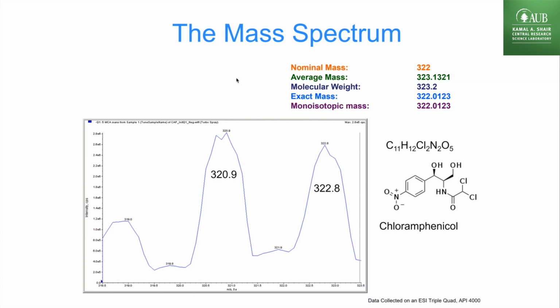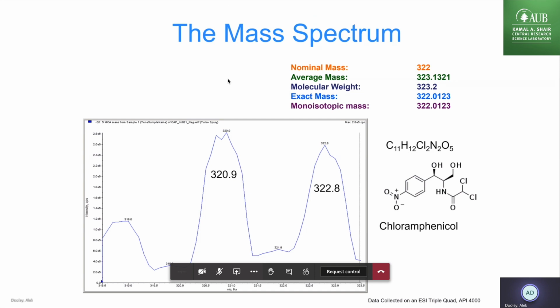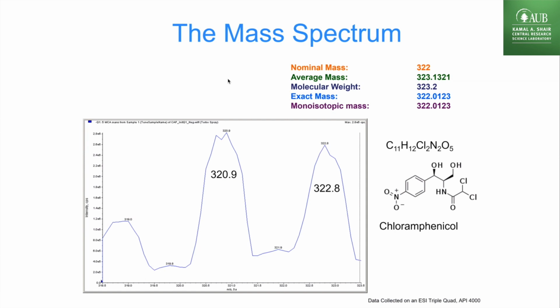Or your professor, whatever, comes to you and says, I want you to measure chloramphenicol. So here's chloramphenicol, and it's an antibiotic, right? So, as a good student, you go to the web, start on the internet, and you get the structure of the compound that you're looking at. You get the structure of the compound, and you get its formula. So you're starting to learn some things about the compound, right?